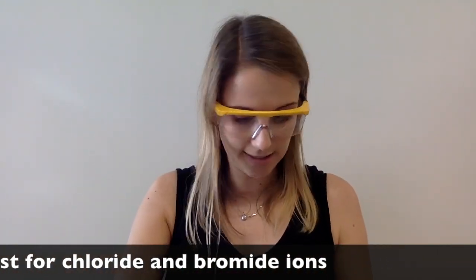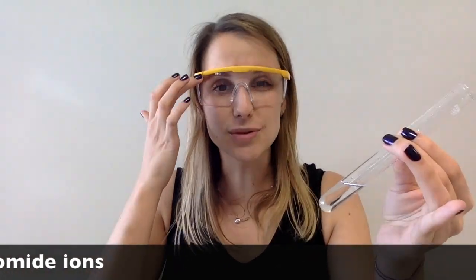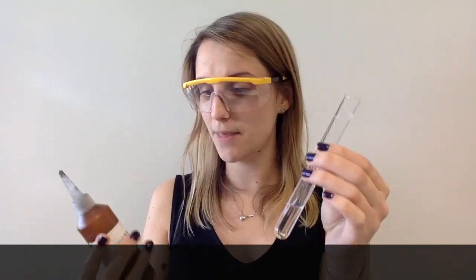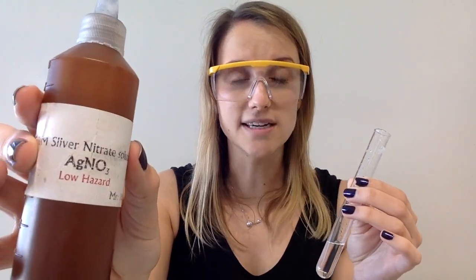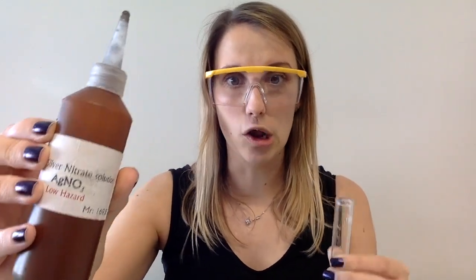remove impurities. All good, so now all clean. In case there's any carbonate or stuff like that in there, it reacts with the nitric acid and won't react with the reagents. The main thing that's going to test for my chloride and bromide ions is silver nitrate solution. We store these in brown bottles because it breaks down in the presence of light, so that means that it lasts a little bit longer.